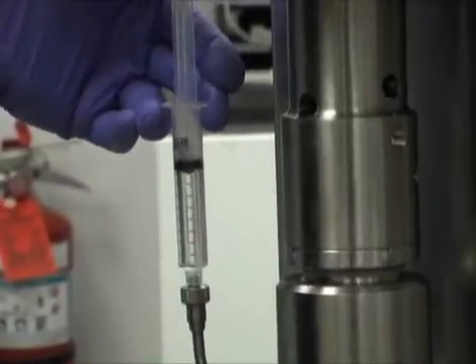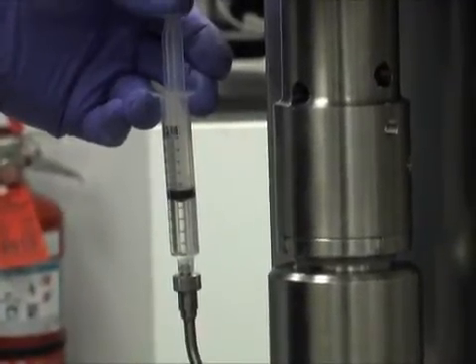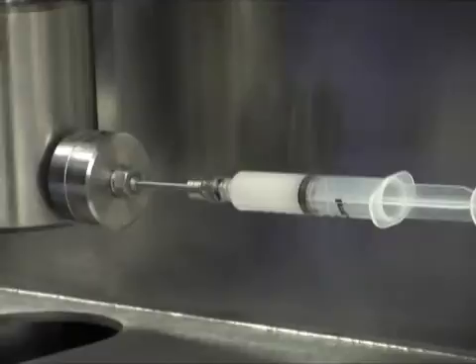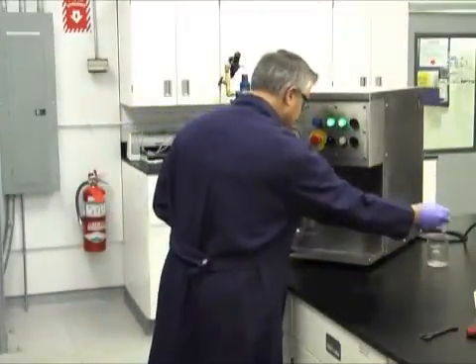Cleaning the machine is just as easy. No disassembly of the equipment is required. Simply run an accepted solution through the processor exactly as you did your product and repeat until the collection syringe contains clear solution. Steam in place options are also available for pharma grade applications.